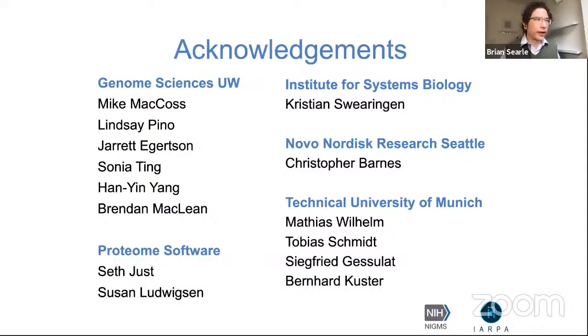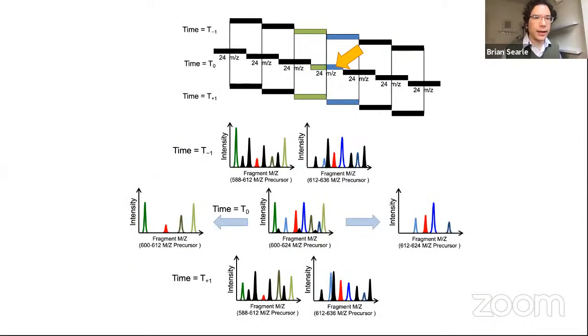Great. So I'll just go through these a bit. For example, the one issue with the staggered window scheme, the overlapping window scheme that I talked a little bit about. So this approach here, I said that this approach isn't compatible with window margins. It's also not compatible with variable width windows too. So that is a limitation.